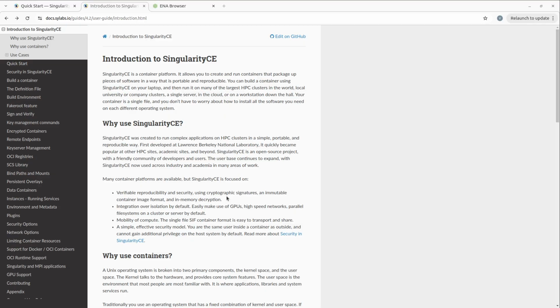Now, if you change platforms, what typically happens is that you have to reinstall the tools again. Now, with Singularity, all that you have to do is to create your container. And if you are moving to a different platform, you just copy that container, which is a single file, and then you can reuse that container with all your software already installed, so you don't need to reinstall the software again. Okay, so it makes things portable for you.